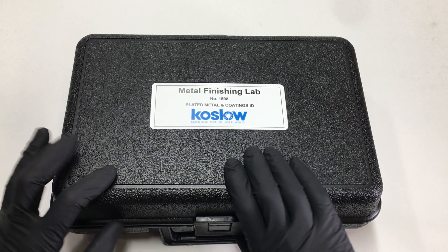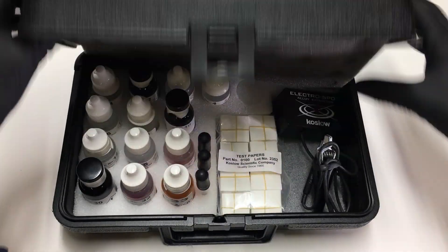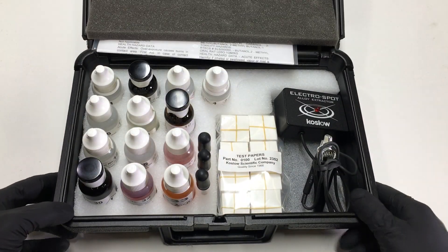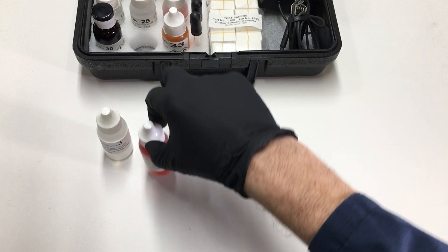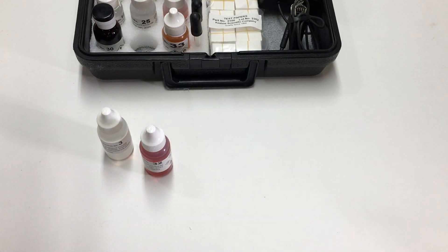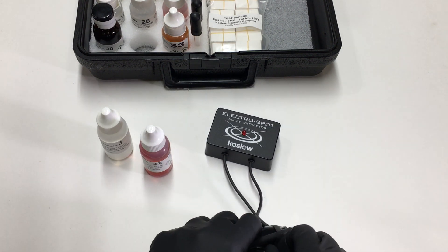Today I'm doing a demonstration of the cadmium test. I'm using the Coslow finishing lab 1598. I need solution number three, solution number 32, and the test papers. This is the ElectroSpot Model 4.